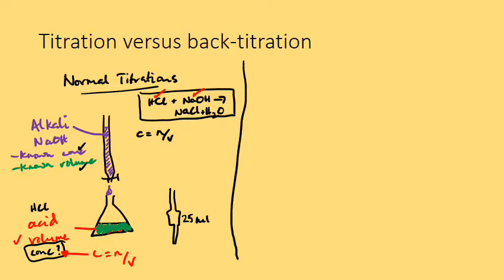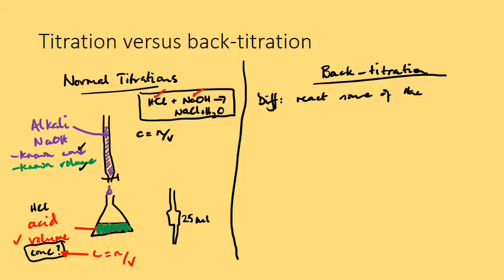And now we'll have a look at back titration. A back titration is pretty much the same, except with one crucial difference. The difference is you react some of the acid with something else first.